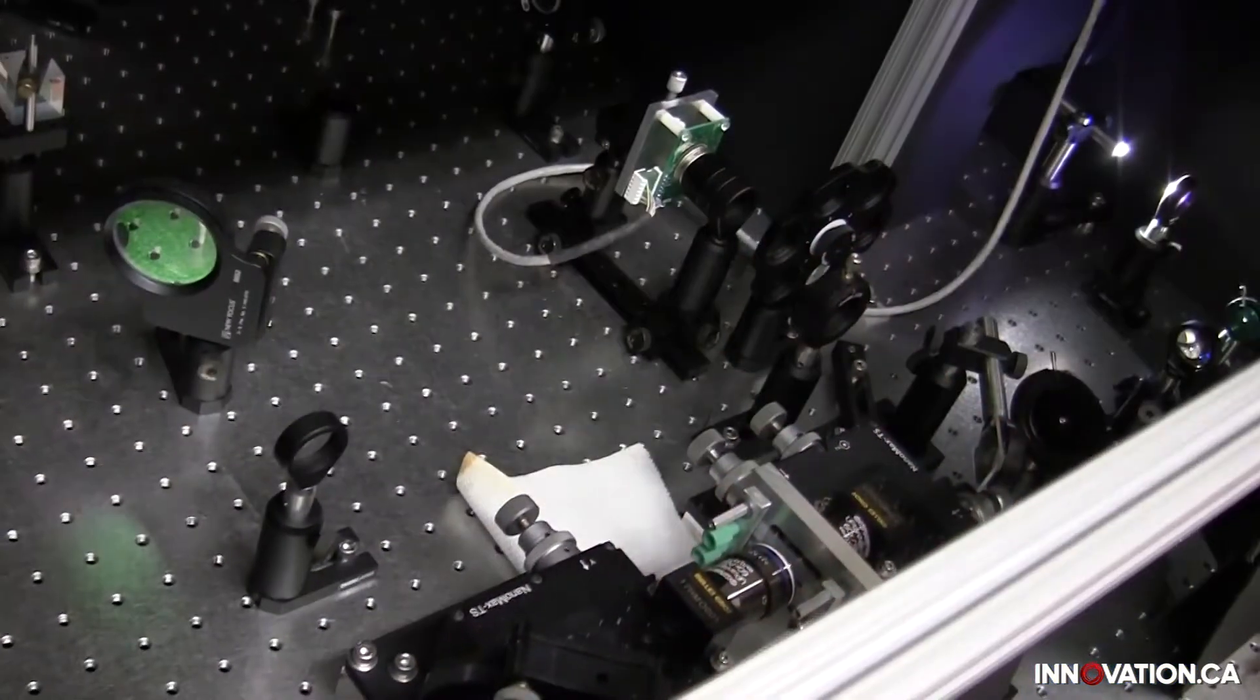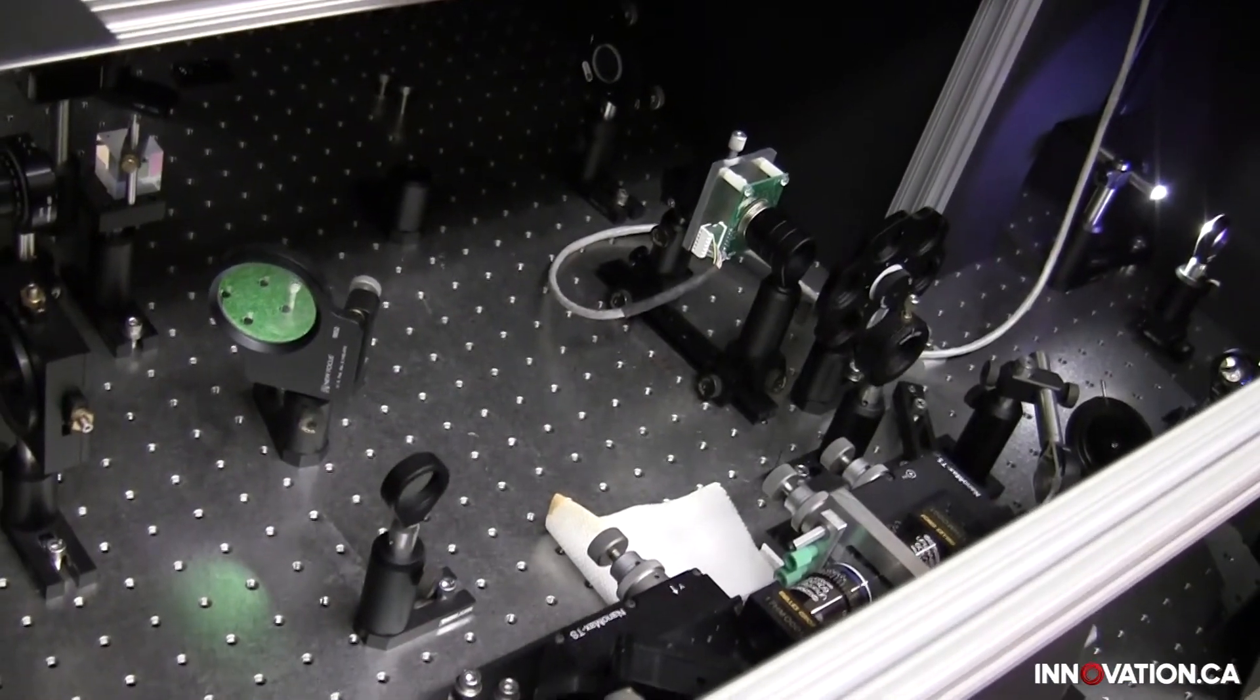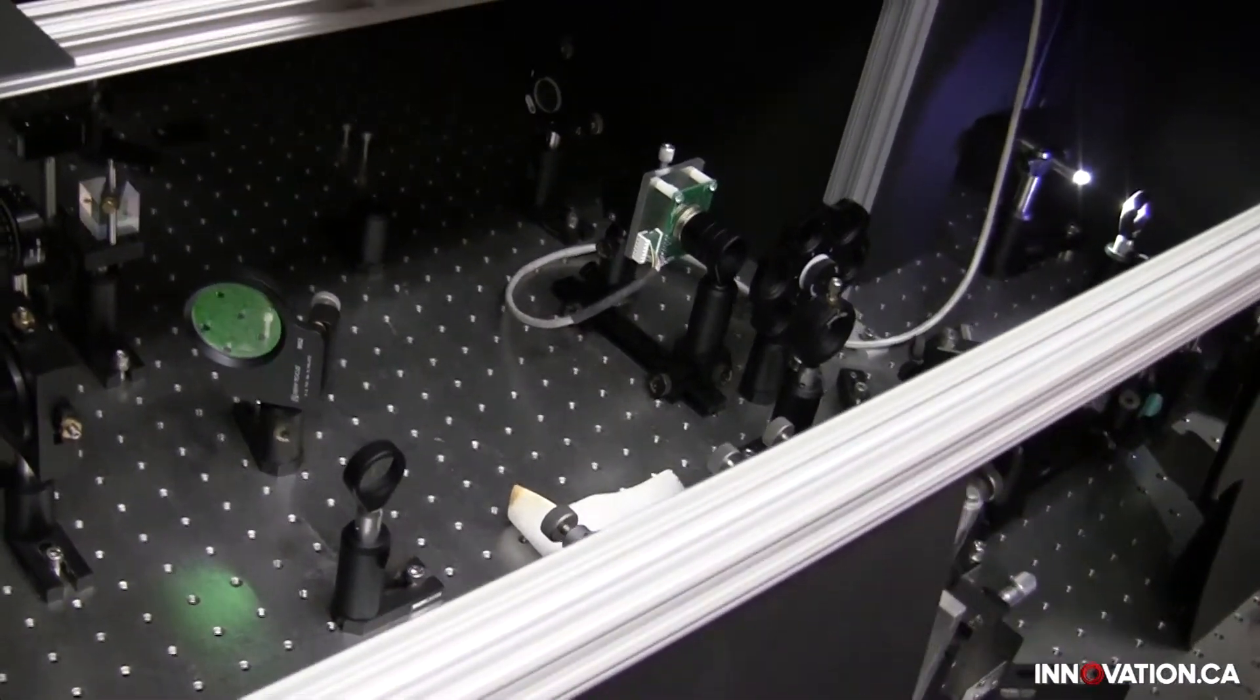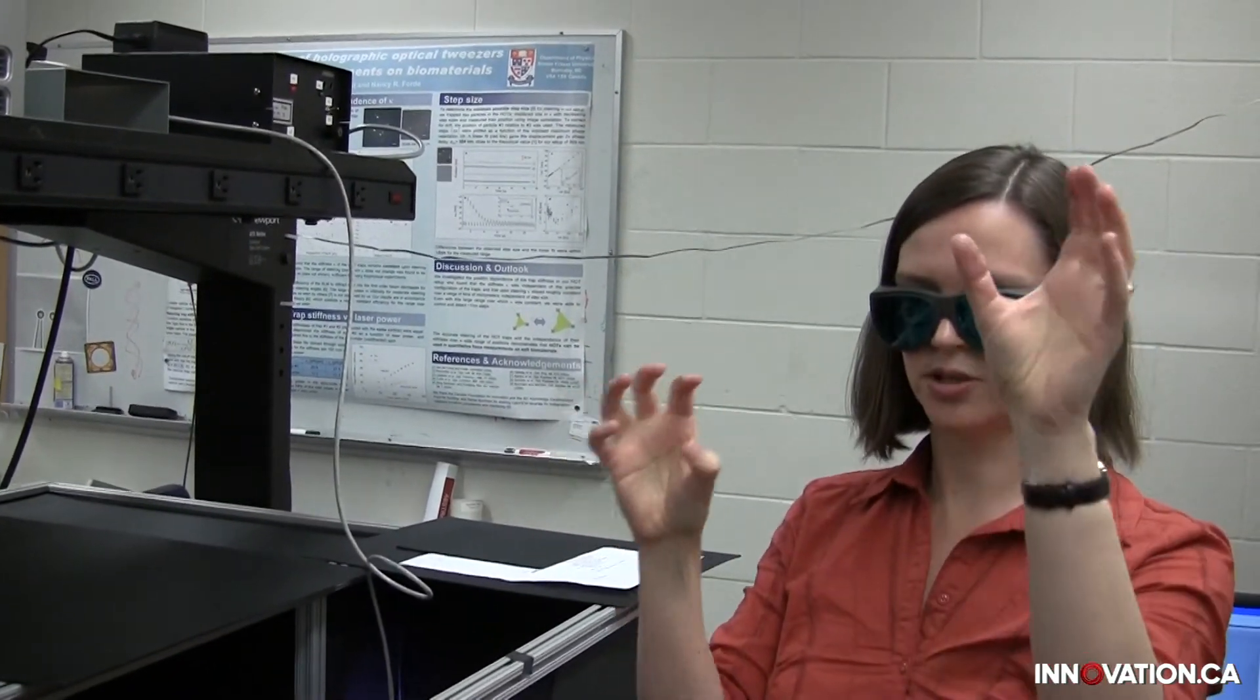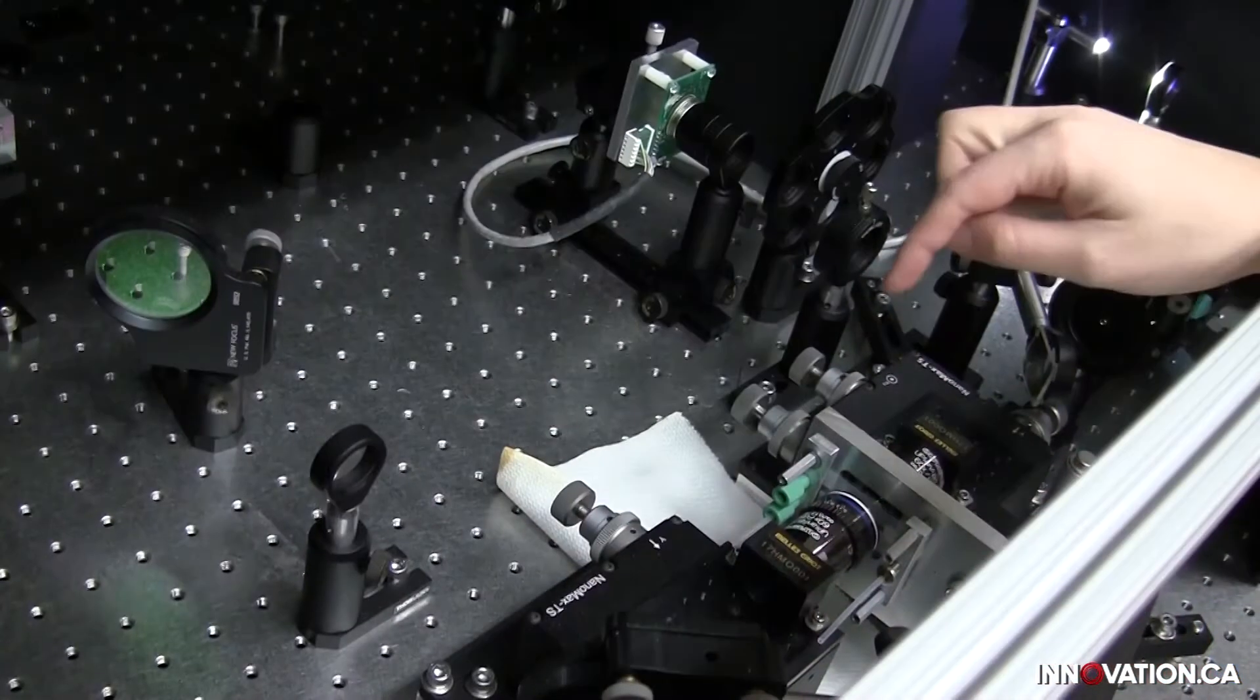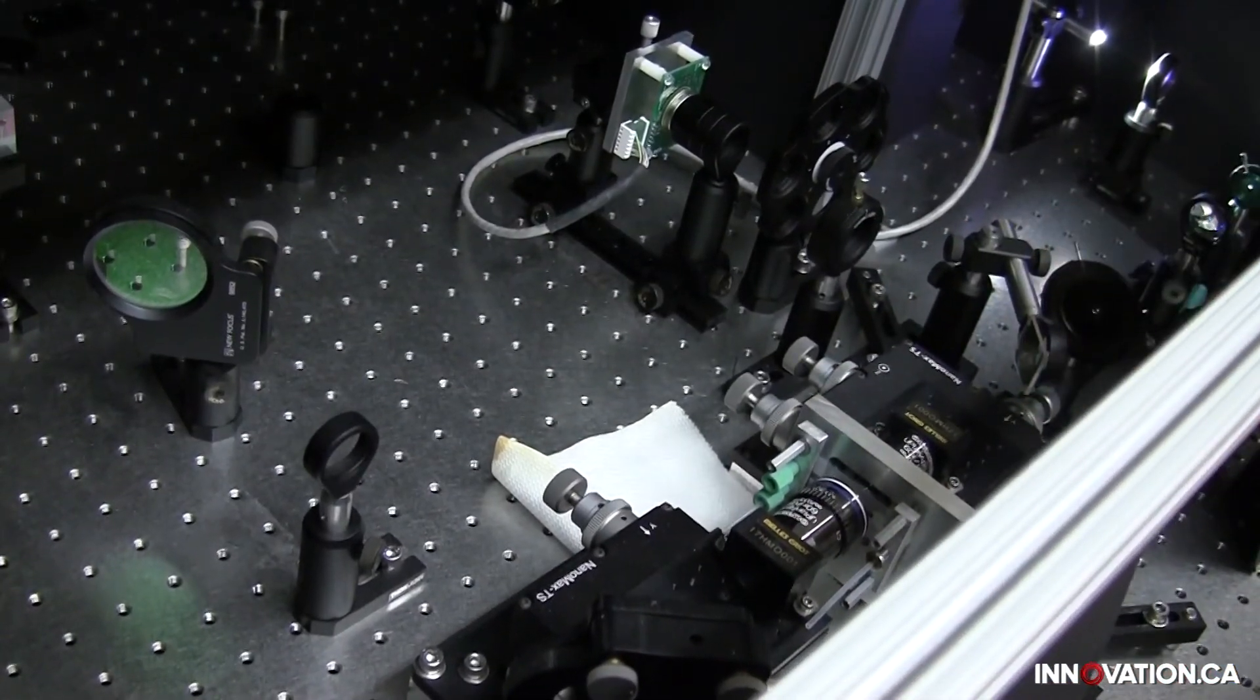This is our holographic optical tweezers and this is the CFI main contribution to our lab's research for which we are very grateful. This is a much more powerful instrument than the single beam instrument in that it allows us to trap multiple objects and probe at multiple locations at the same time within a sample.